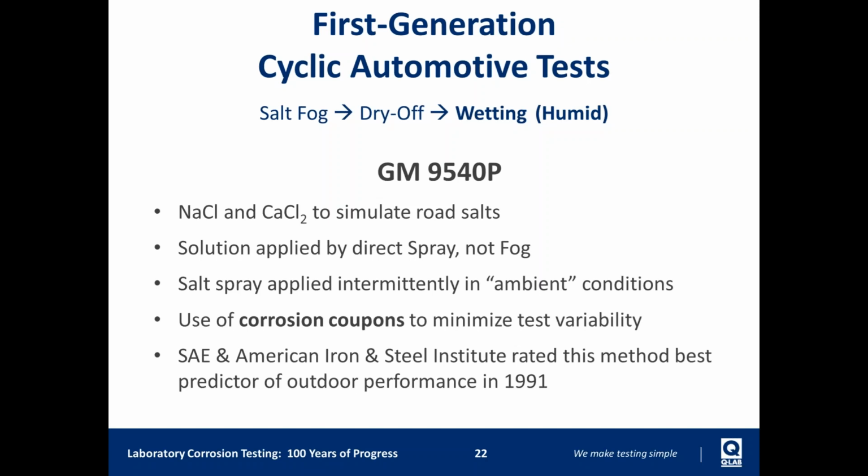So they chose to use sodium chloride and calcium chloride because that's a common salt used in road salts. And they wanted the solution to be applied directly because it is going to be washing away. If you're splashing the salt solution off the road onto your car, that's going to wash materials away, and it's also going to apply salt a lot faster than a fog. The salt would be applied in ambient conditions in order to try and control that step of the method.